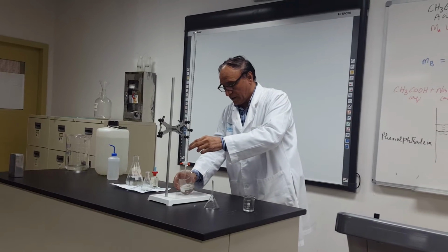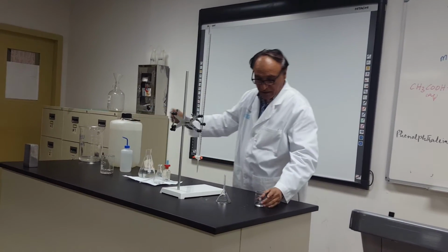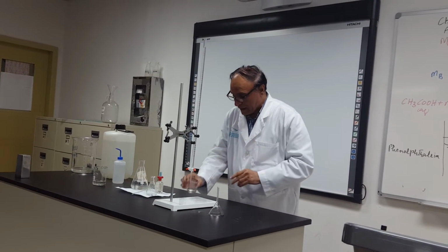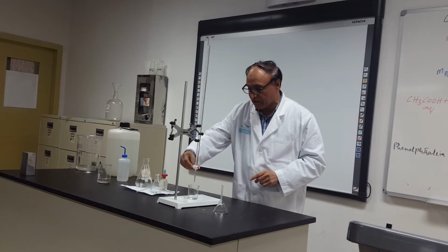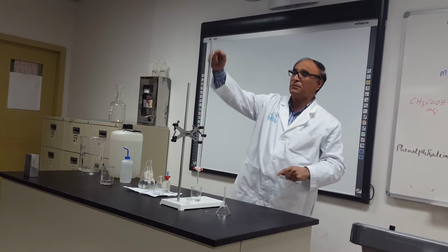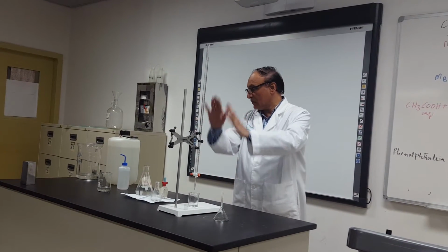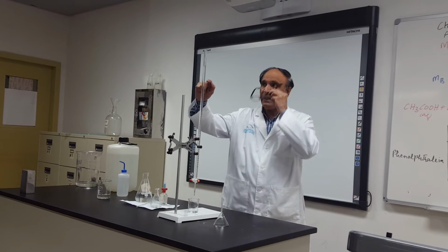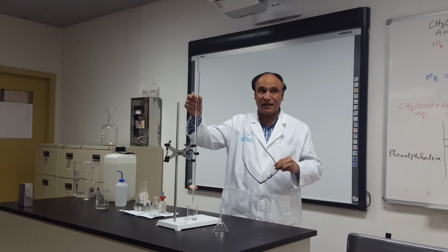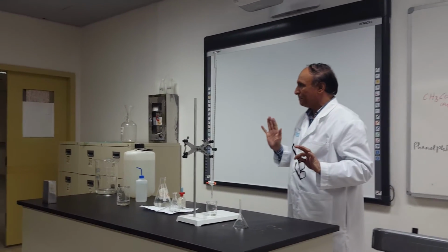Now you remove it and put it on one side. Take this beaker, what is here? Sodium hydroxide. Open it fast to move it down and bring it to any position, so that all the air goes down. And bring it to any point, here, here, here or here. It makes no difference. I am telling you so many times, it makes no difference. So bring it to any point.